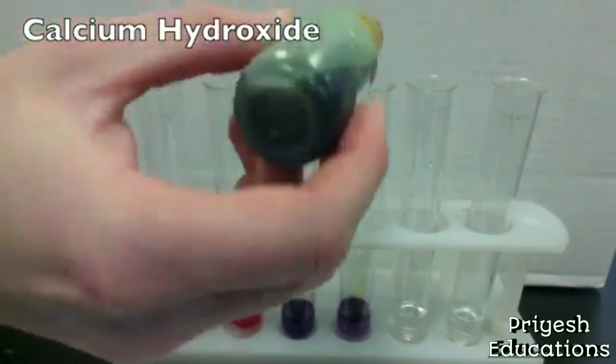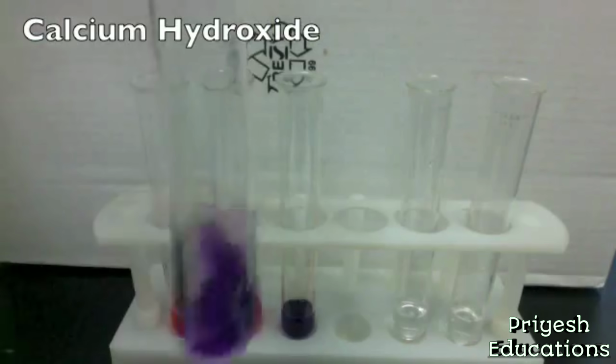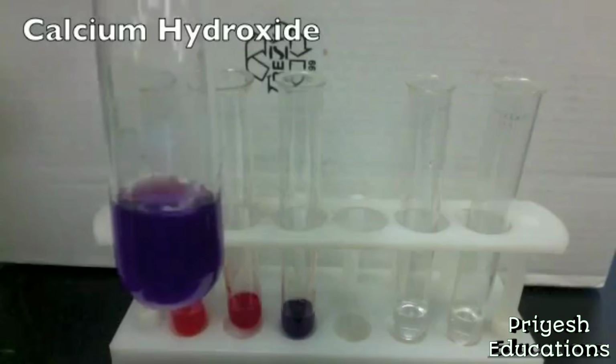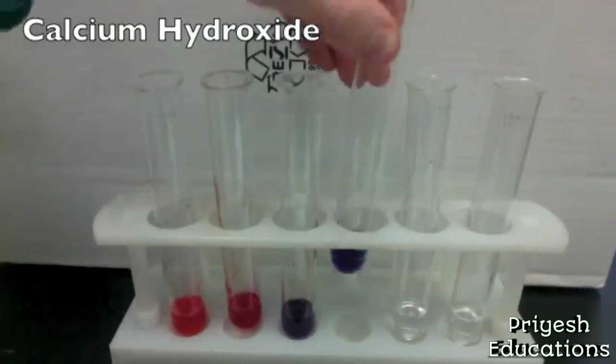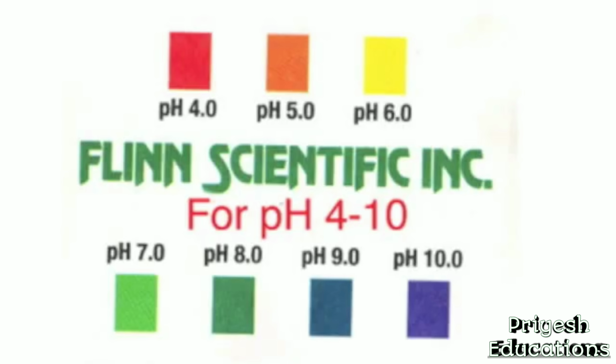If we test calcium hydroxide, we also get a purple color, which again will correspond to a pH of 10 or higher. We would need further testing, however we won't do it at this time.